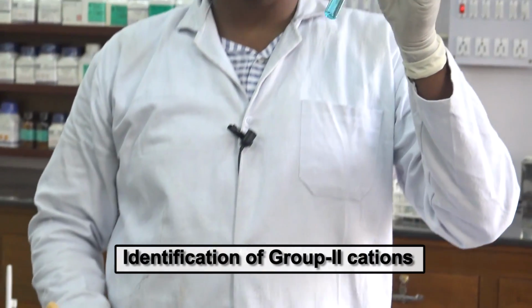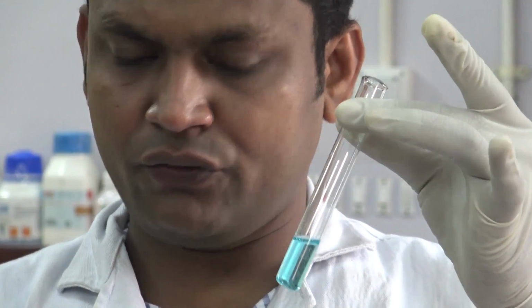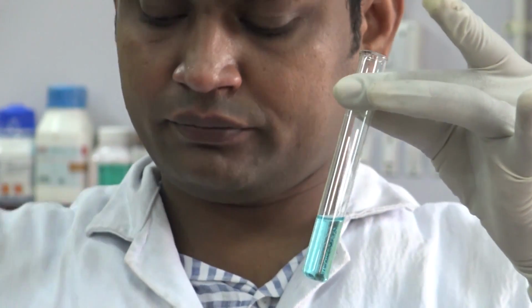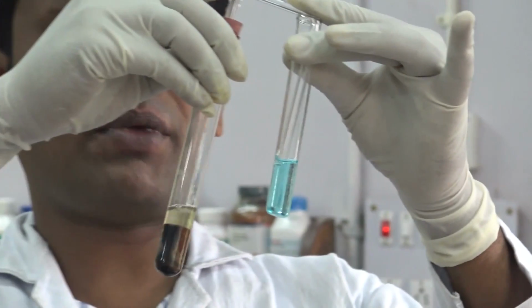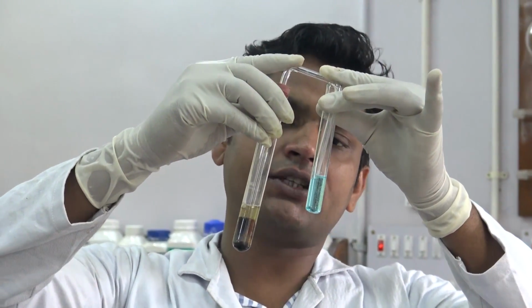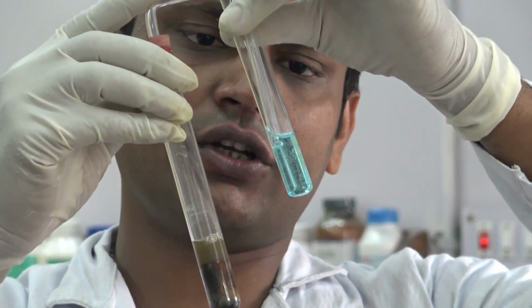Now test for group 2 cations. I have taken a known test sample which belongs to the group 2 cations and acidify this solution by adding dilute HCl, then pass H2S gas through the solution. The group reagent is HCl and H2S, that is, in acidic condition H2S should be passed through the sample solution.